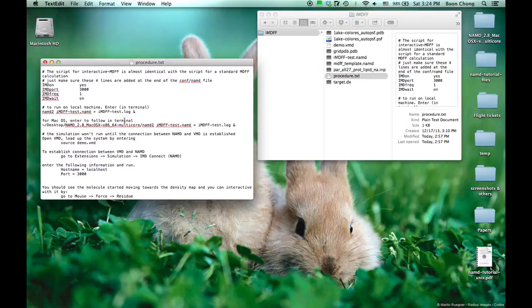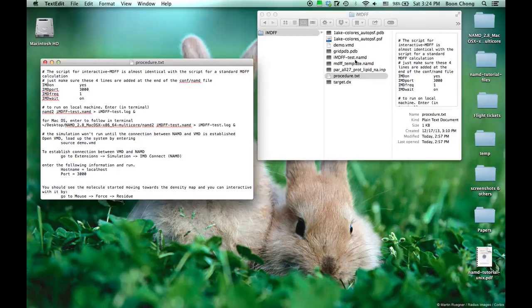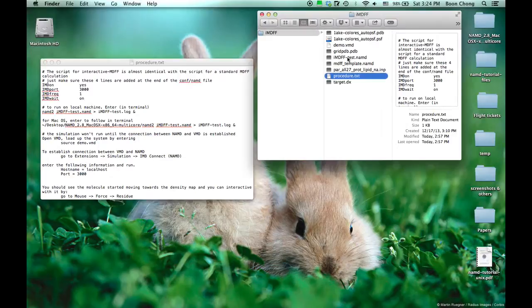The first thing to notice is that the script for interactive MDFF is almost the same as the script for a standard MDFF calculation. So let's look at the configuration file.